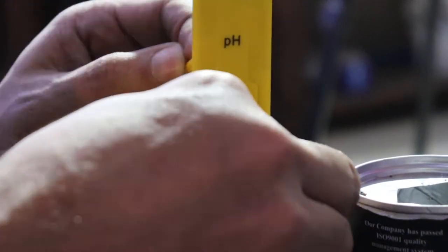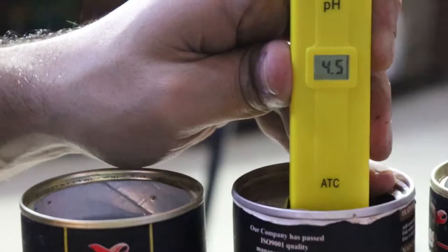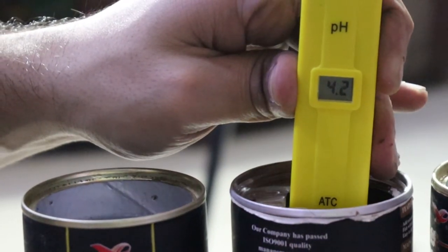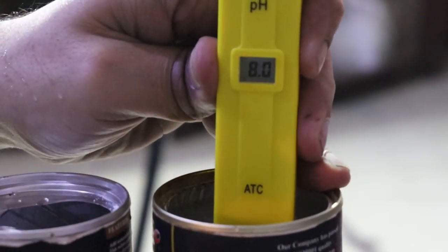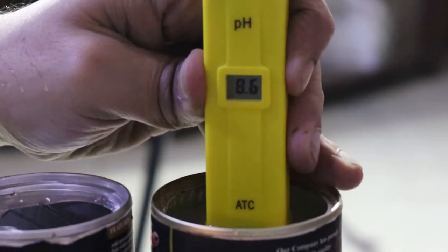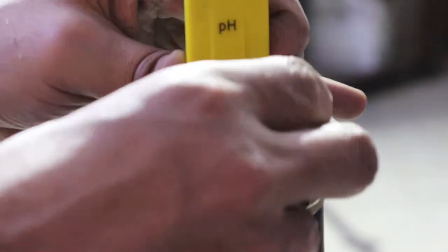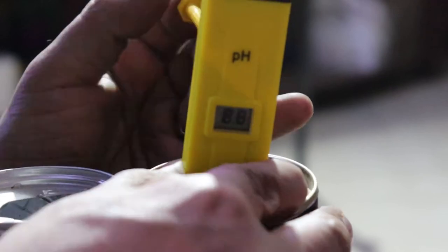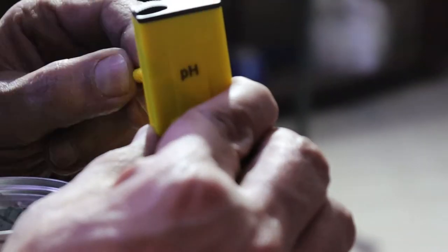Turn the pH meter on, remove the cap, and dip it in the first solution. Once you have done that, proceed with the next two containers to complete the calibration.